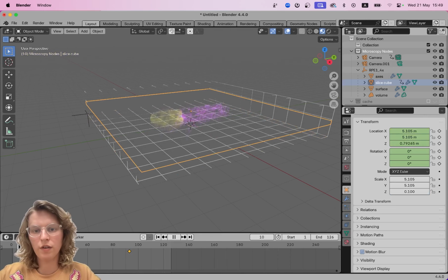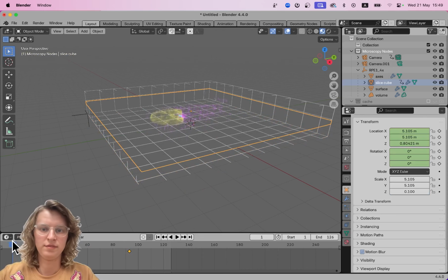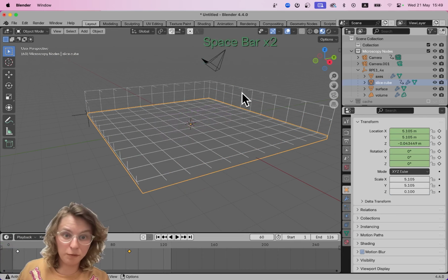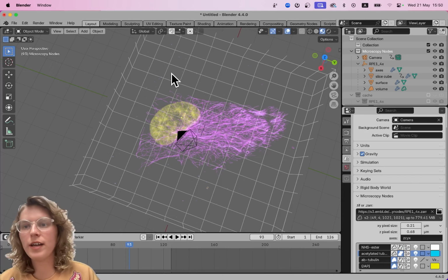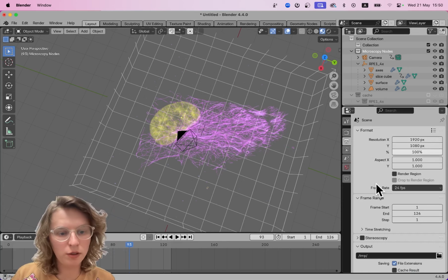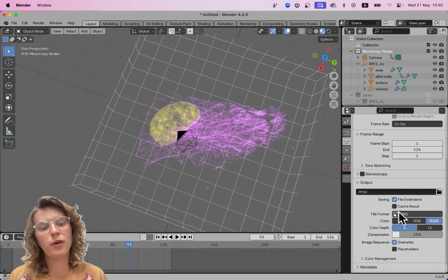And then we have an effective Z slicer, which of course doesn't really combine with our camera. So our rendered animation, if we press render animation, it will arrive here in output. We can see where these files will actually be written.